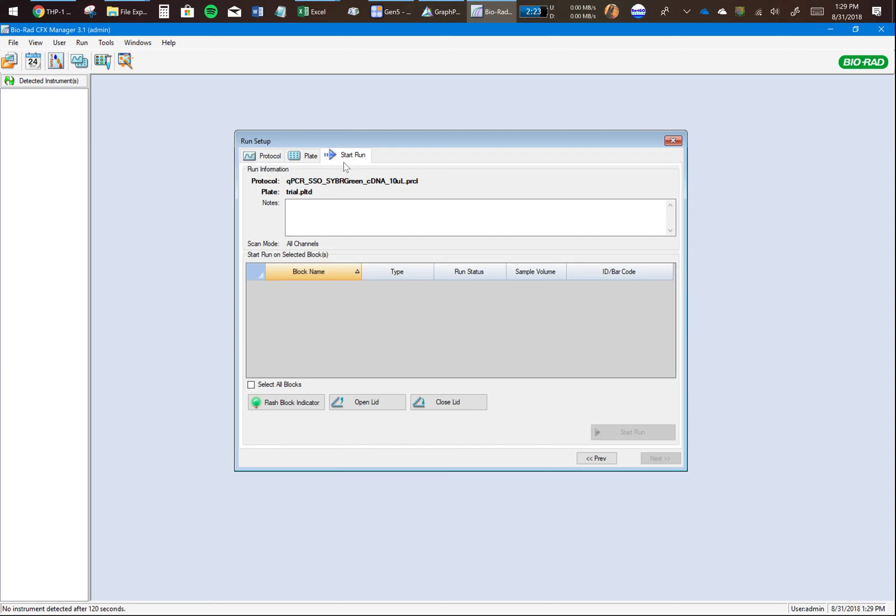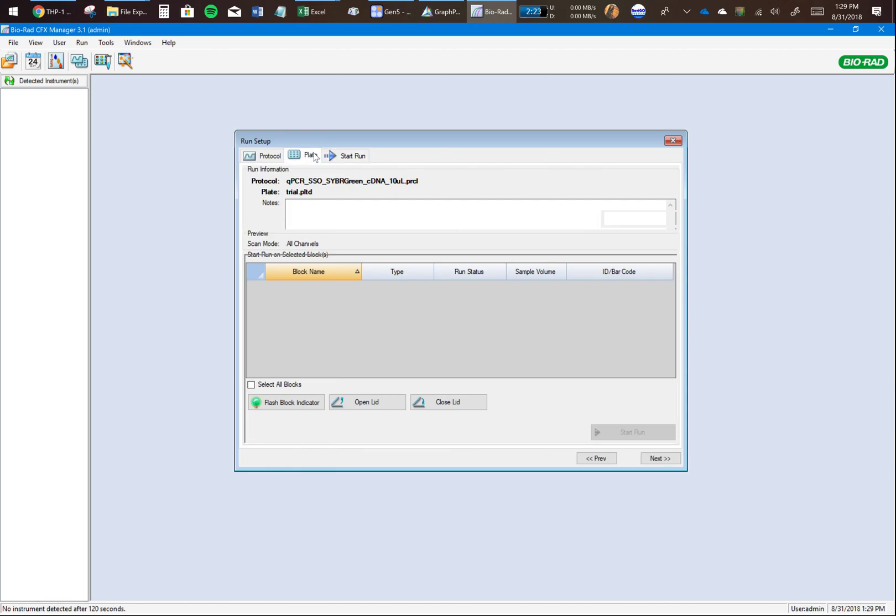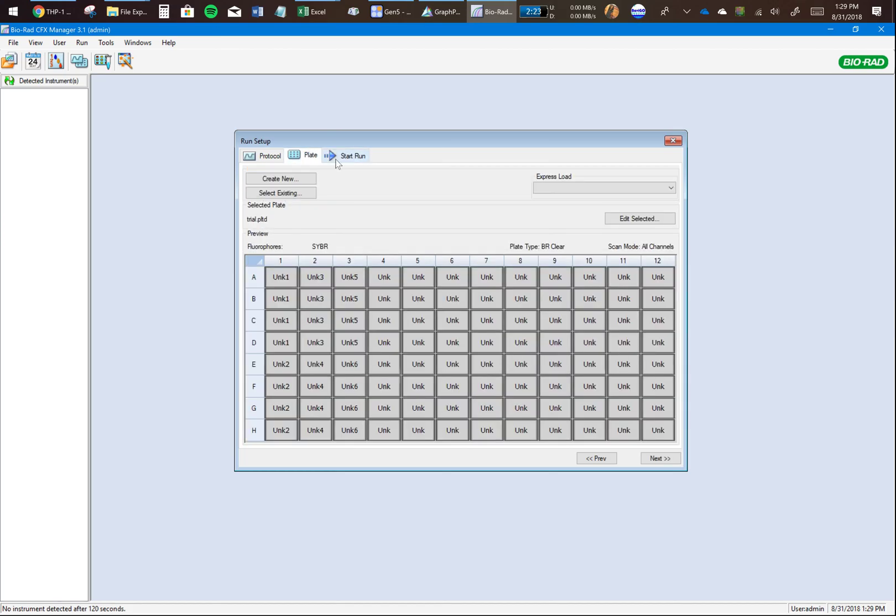You will click on Start Run. It'll give you an option to save your file, the result file. You will save it with whatever name you want. I would normally suggest that you give the plate file and the result file the same name so that it's easier to match them later on. Also remember, there's a different file for the plate - this file tells you how the plate was set up. The result file will tell you the expression levels. Do not confuse between them. That's how you use CFX Manager for the CFX Connect 96 instrument. Thank you.